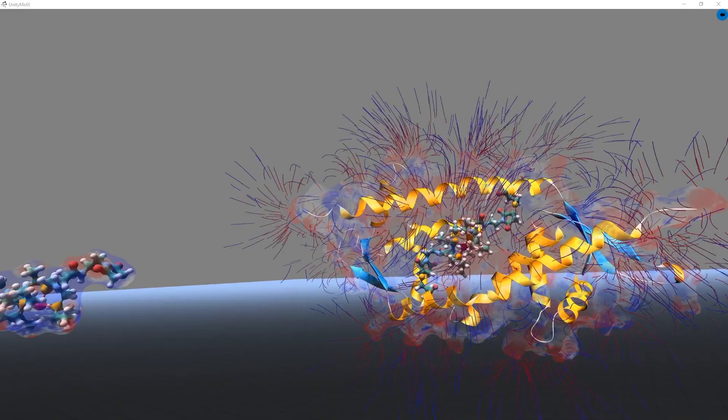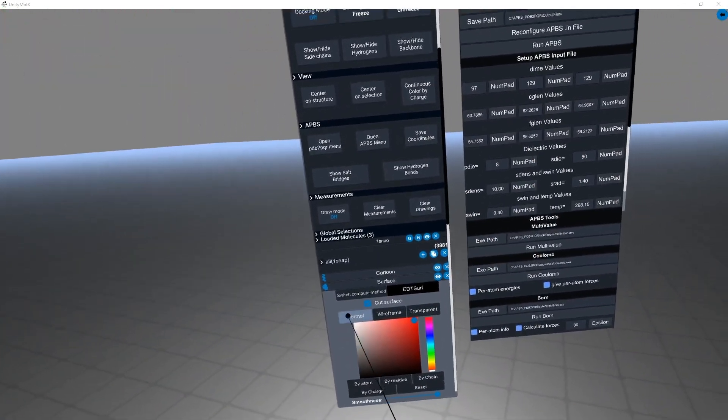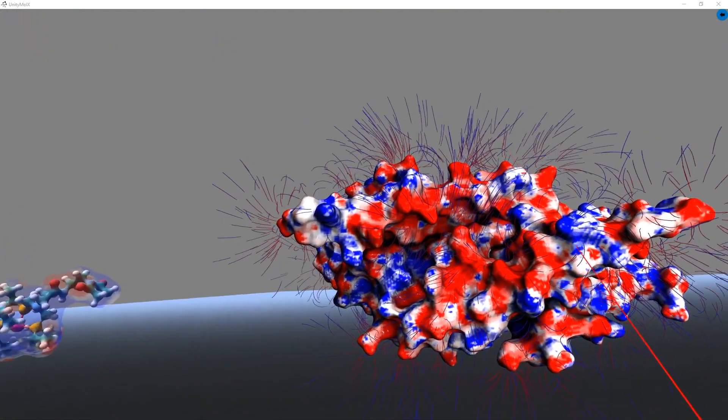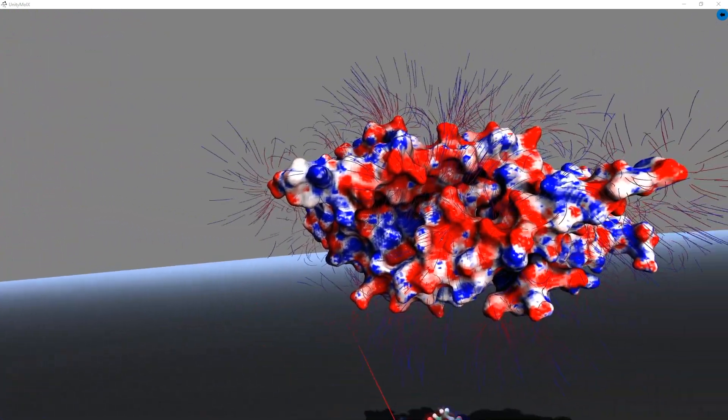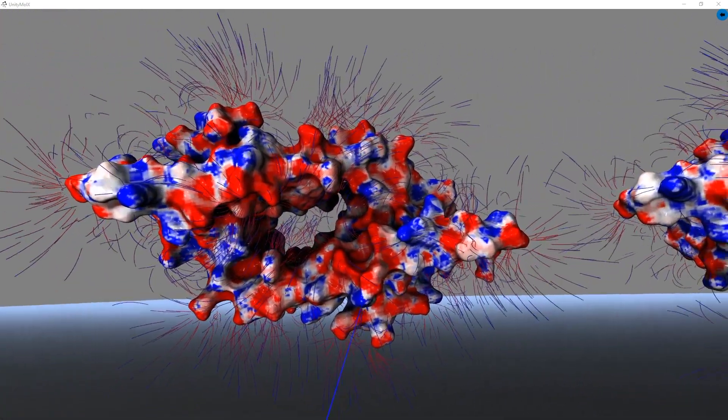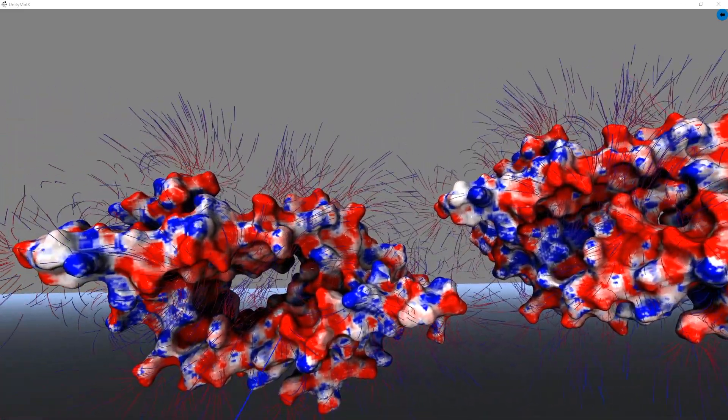We can now represent our enzyme as a solid surface. After we do that, we can now compare the electrostatic surface potentials of our artificial enzyme to the native LMRR system.